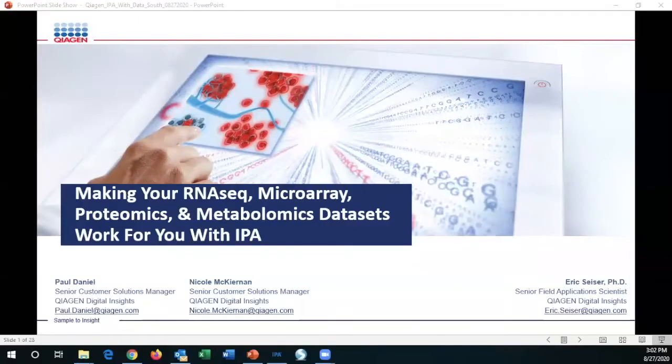Again, for those of you who are joining on, we're continuing from our earlier session where we talked about some of the basics of IPA. Now, in this later section, for those of you who have worked with IPA, perhaps entered your data into IPA, generated some results, and are perhaps unsure how to parse through that information, we're going to focus on that this afternoon.